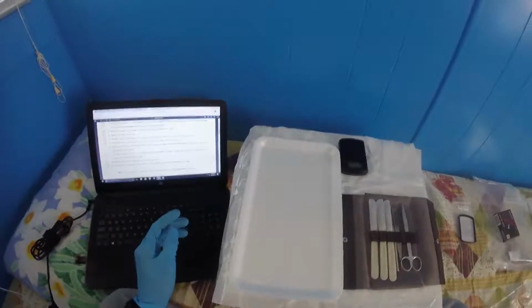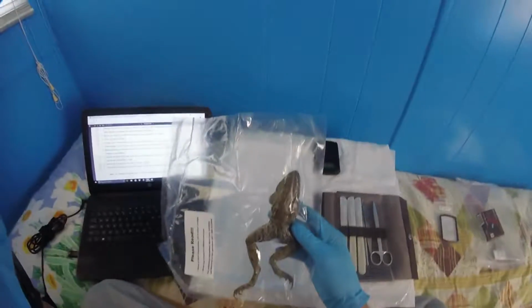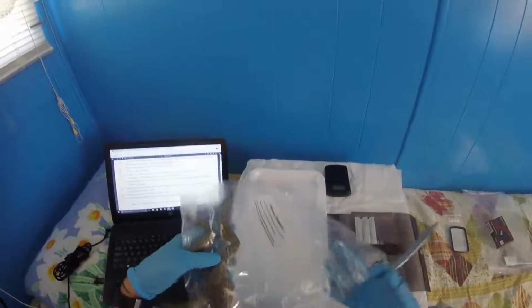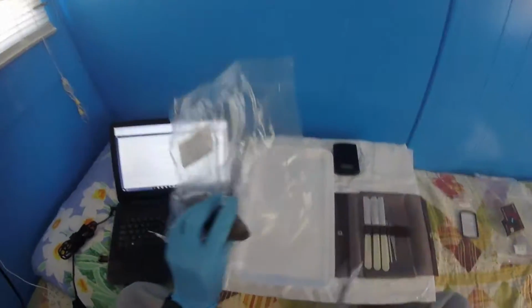Alright. So, here goes my frog. So I guess let's cut him open. I guess the best way would be to cut it this one.